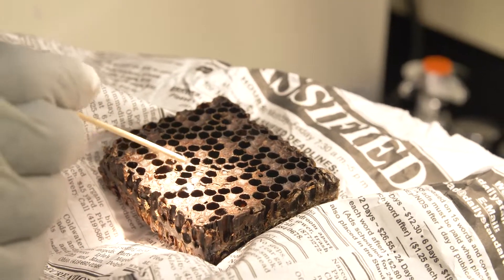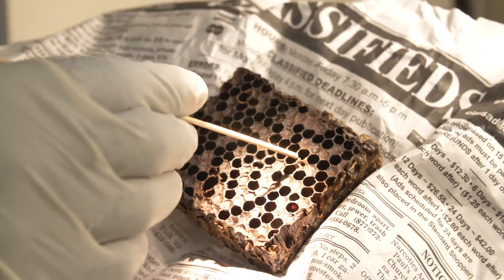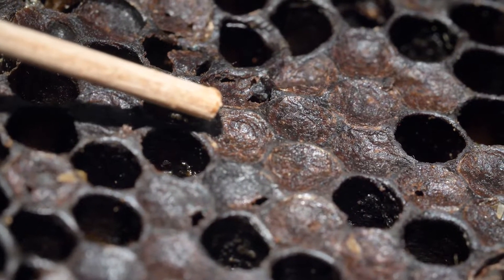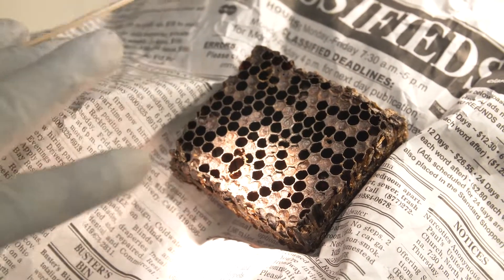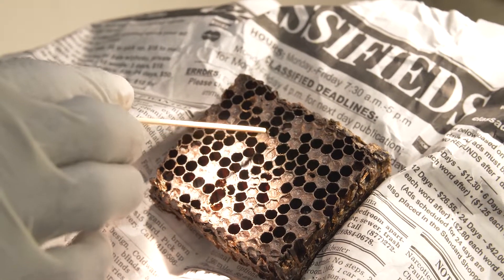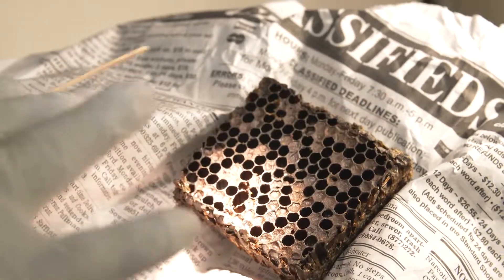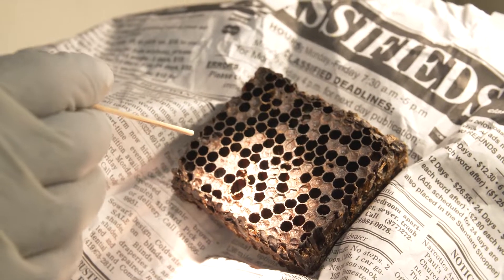In this case, I'm seeing some comb brood with open cells with holes on them, and a kind of concave, sunken appearance. In normal brood, you would see a nice convex capping, but in this case it looks diseased because the top cover has already collapsed and is sunk in — a telltale sign that disease may be present.